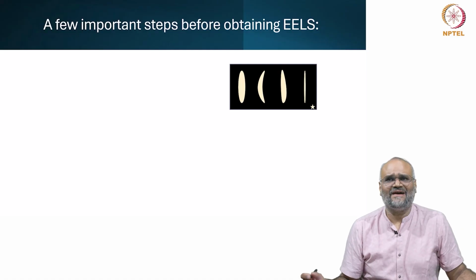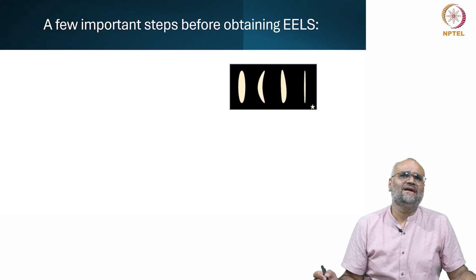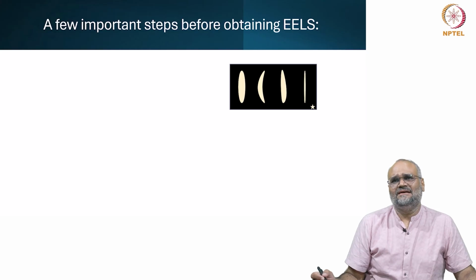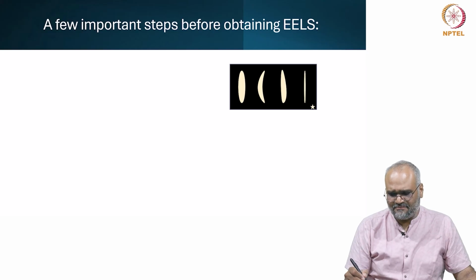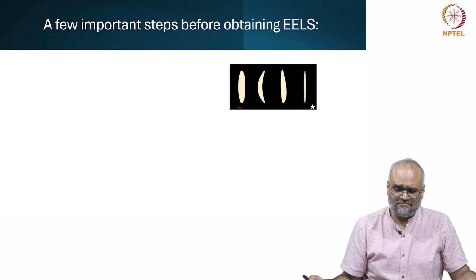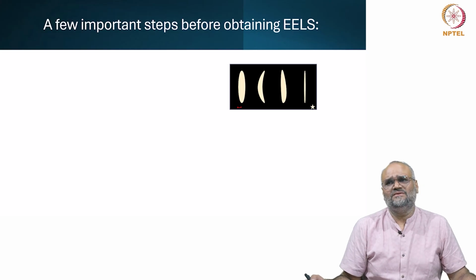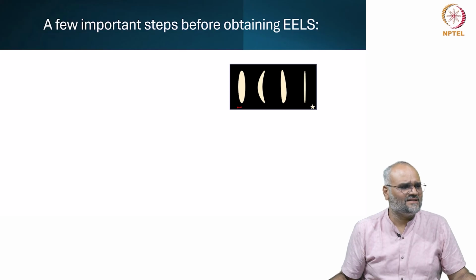looking at something called the fast scan camera, you can look at how the spectrum image is before I correct the spectrometer. There are a series of electromagnetic lenses also in the spectrometer. Typically, you see this kind of a shape. So you have different kinds of corrections. You have the coma and the magnetic field compensation which is done. Please bear in mind that electron energy loss spectroscopy is extremely sensitive to stray electromagnetic fields. So ensure that there are not many stray electromagnetic fields or that these are corrected.